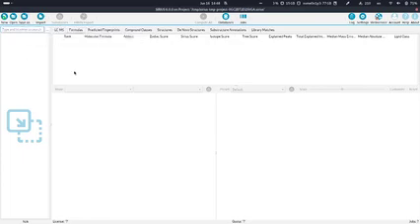But what is also important, you will see here in the menu bar, I think it's a little bit small, I hope everybody can see it, that we are running SIRIUS 6, and we are already on some project, which, because it's on Linux, is in the temporary location. So even if you just load in some data and you don't save it, it will be automatically saved in this temporary directory. But of course, at least on Linux, this will get deleted if you restart your system, so if you have done some important computations, you should definitely save everything.